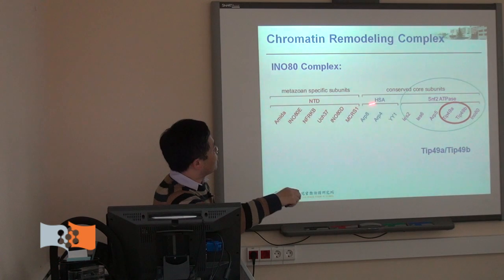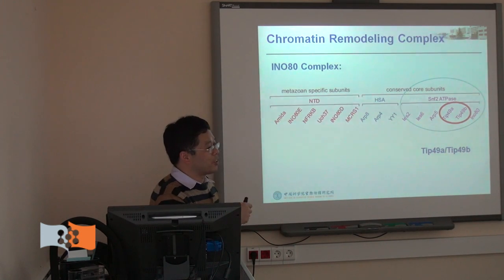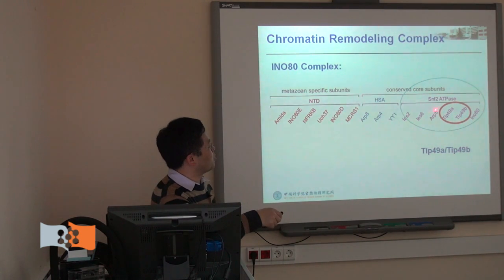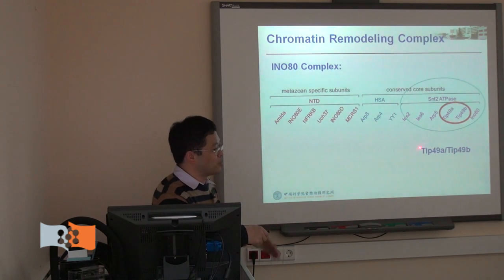They are around 16 to 17 subunits. So we are trying a different strategy to work on this one. We're trying to build it one by one. This is a typical way, so build it from bottom to top.